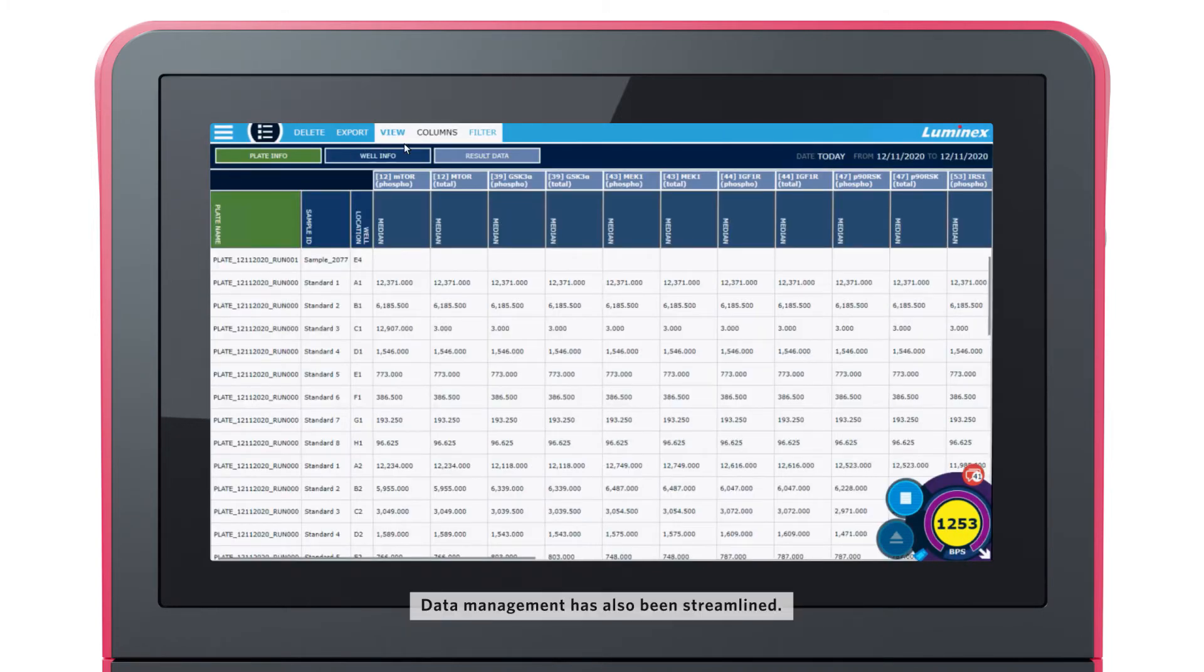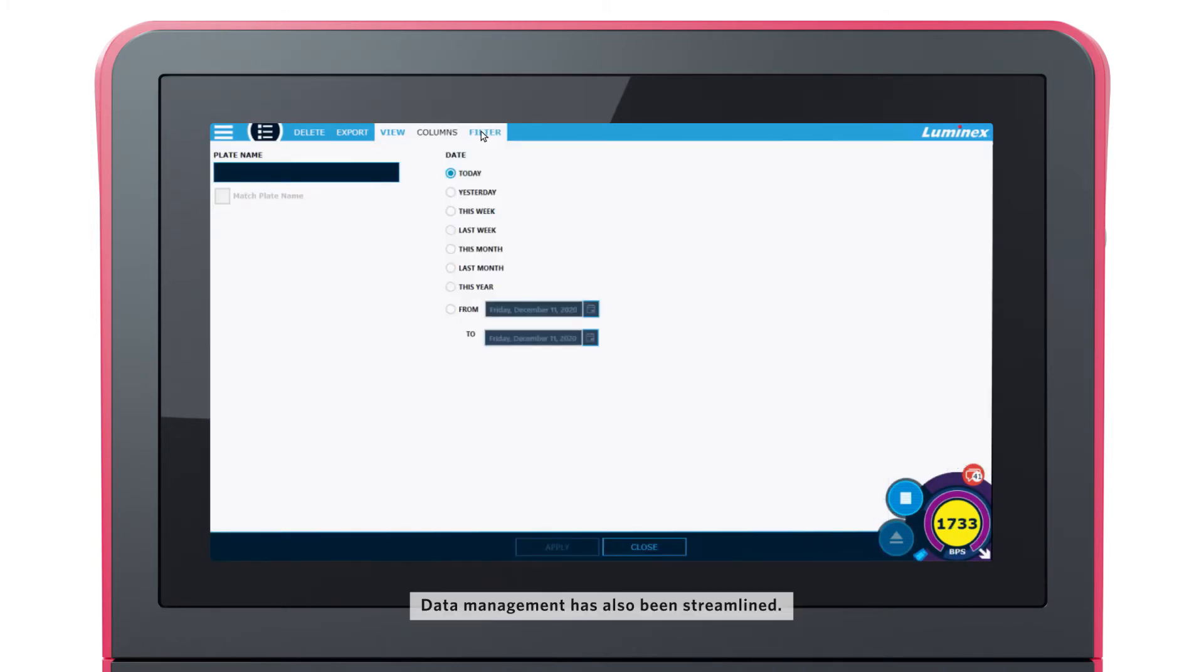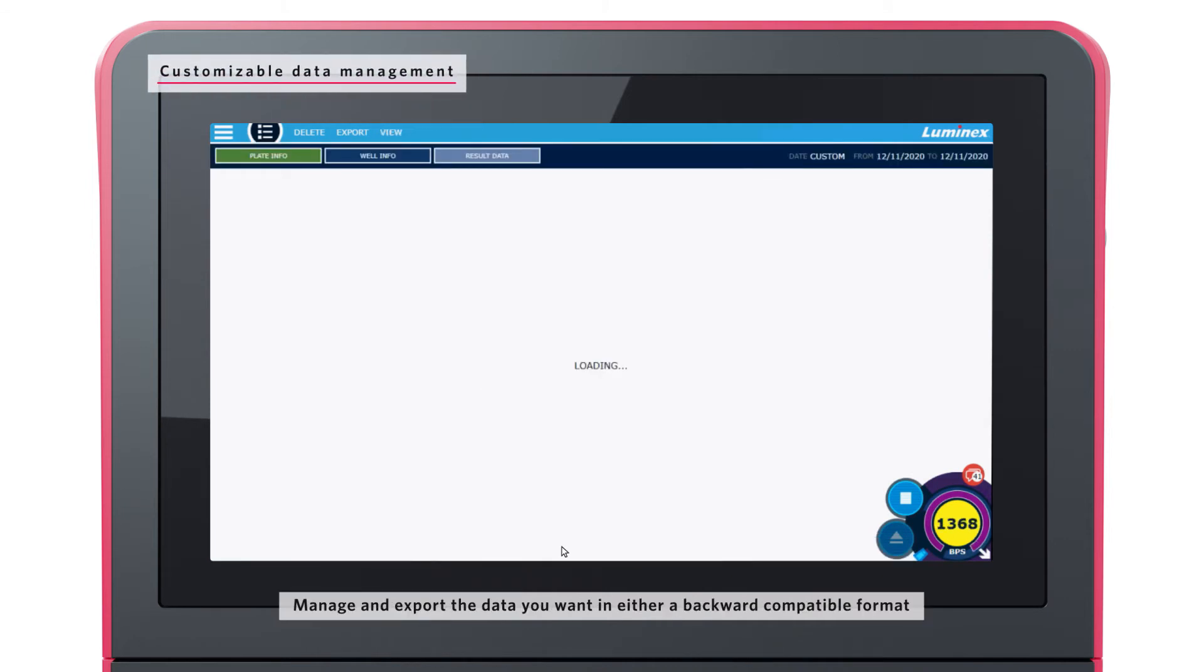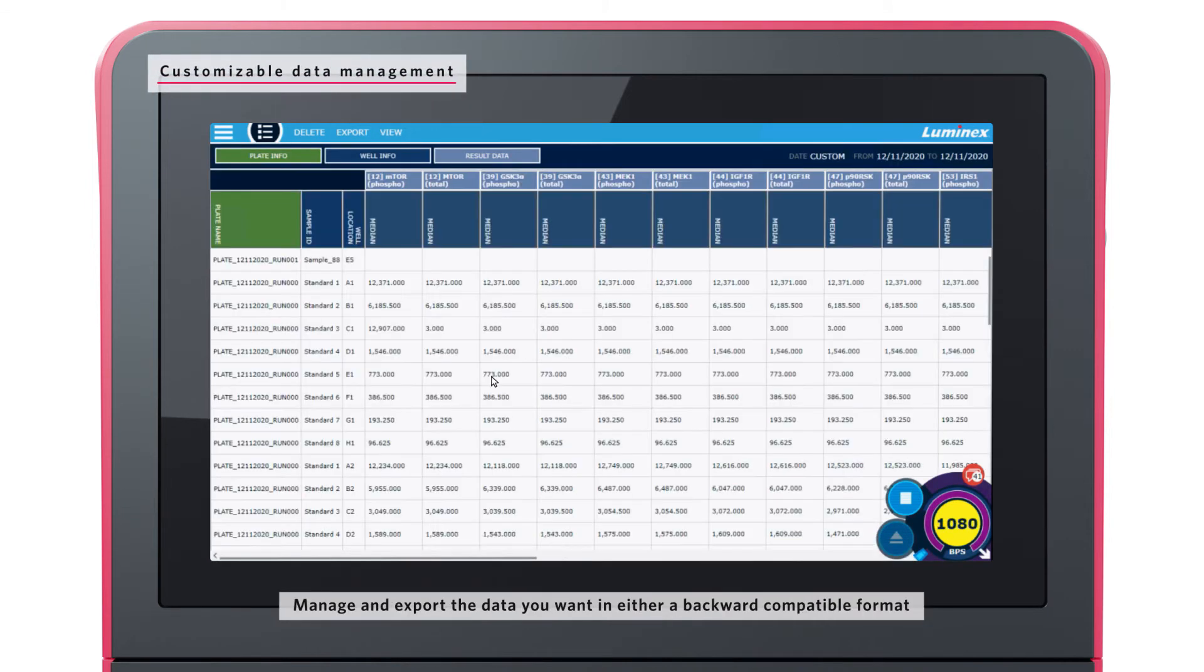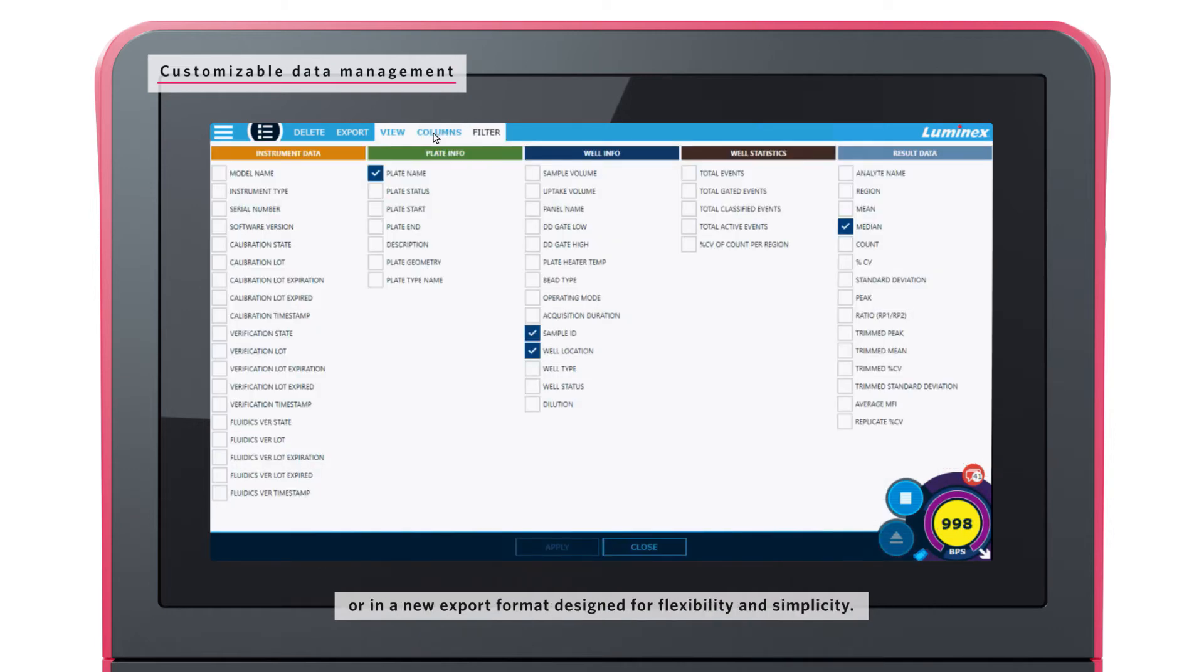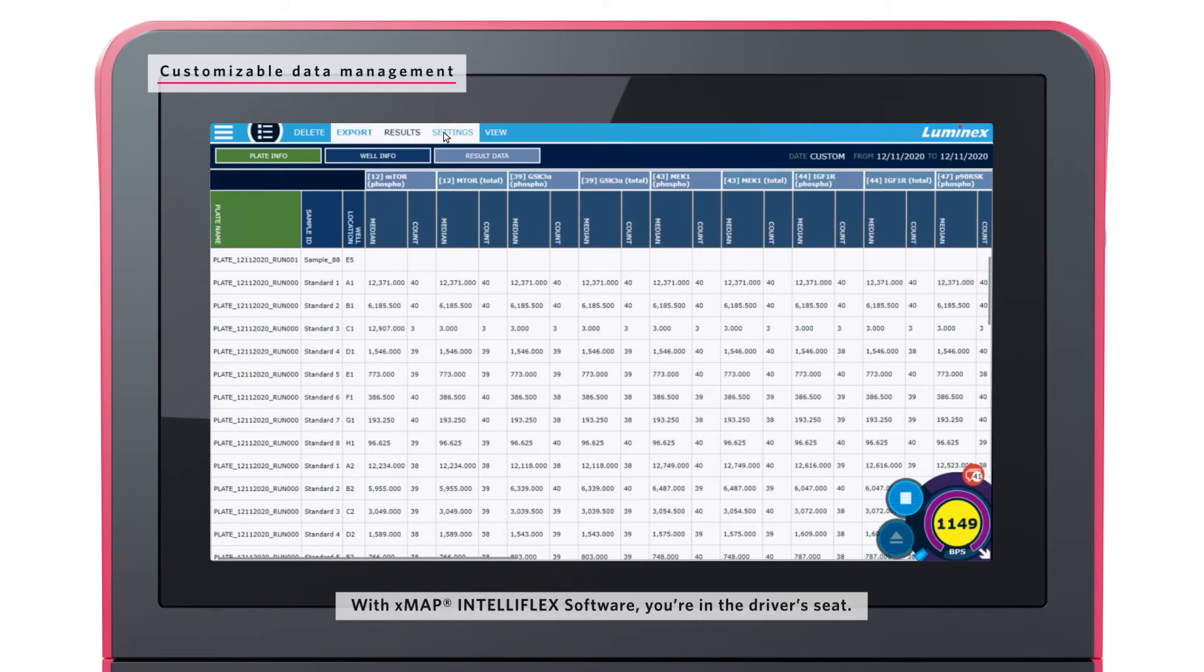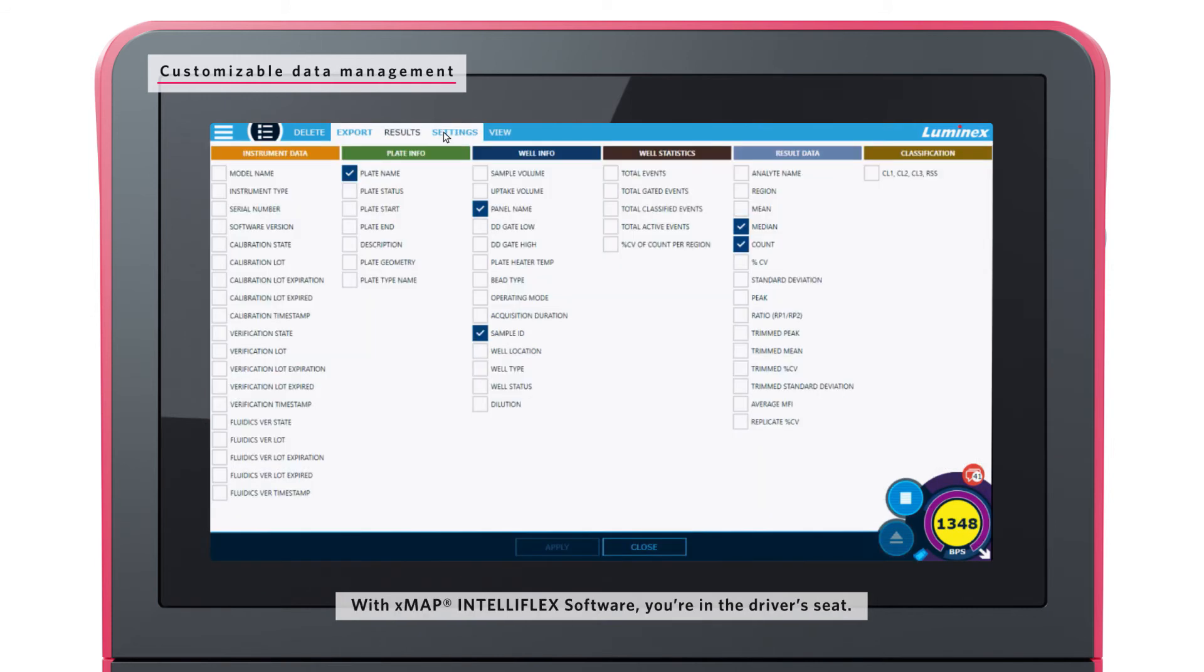Data management has also been streamlined. Manage and export the data you want in either a backward compatible format or in a new export format designed for flexibility and simplicity. With xMAP INTELLIFLEX software, you're in the driver's seat.